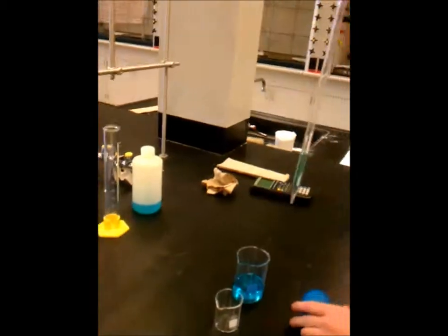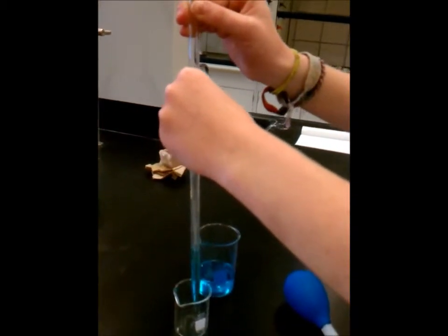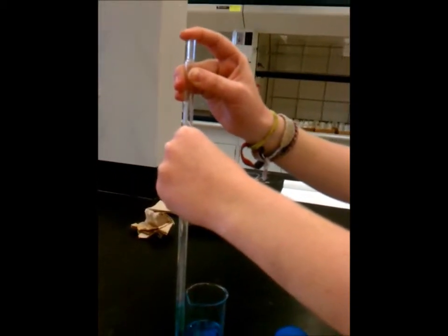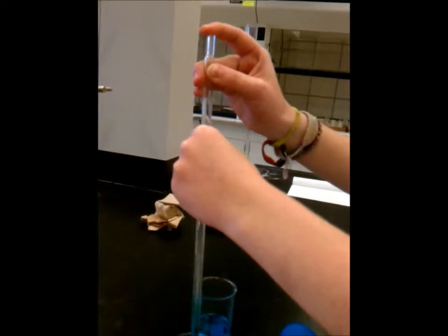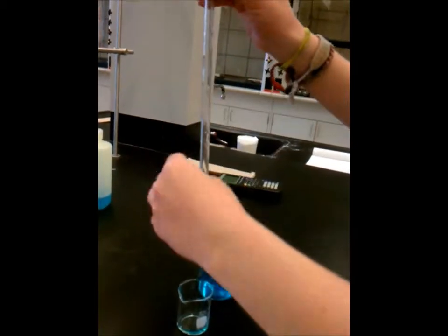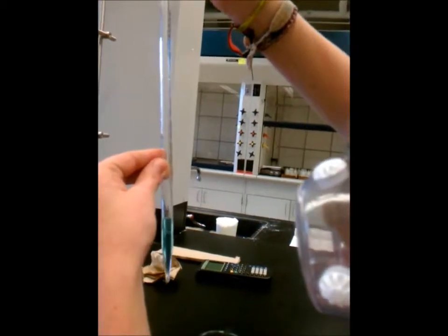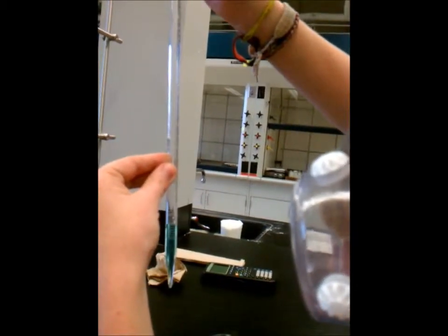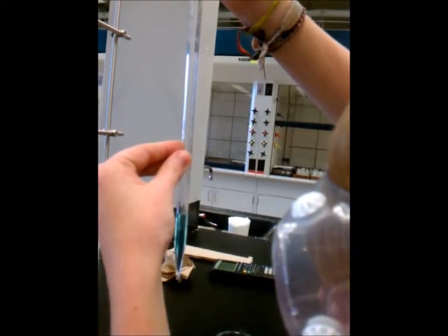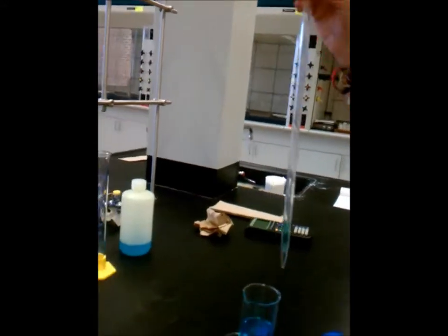Okay. And then now we're going to find the final volume. You do this by releasing your index finger, and you want to make sure you hold it with your index finger because that's the most secure way. And then this is my final volume. It's going to read 9.38.